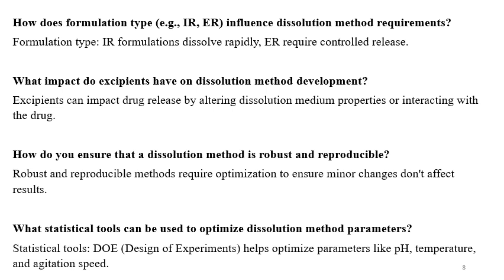What impact do excipients have on dissolution method development? So excipients can impact drug release by altering dissolution medium properties or interacting with the drug. How do you ensure that a dissolution method is robust and reproducible?